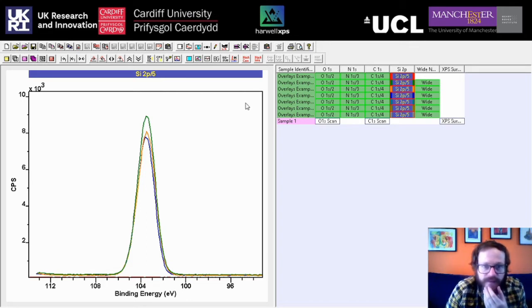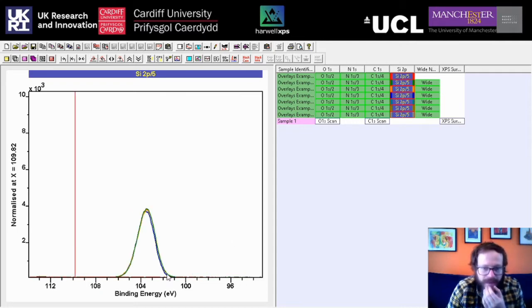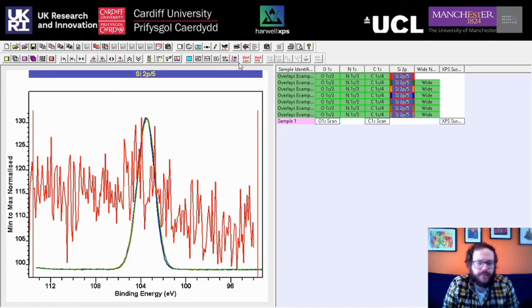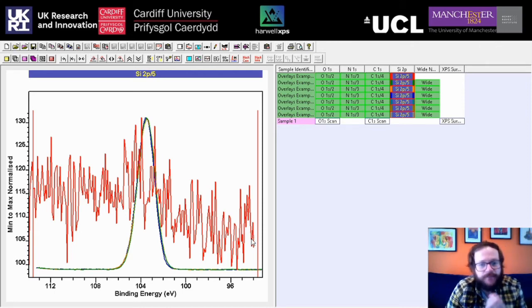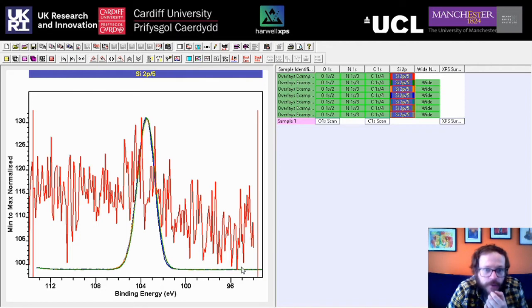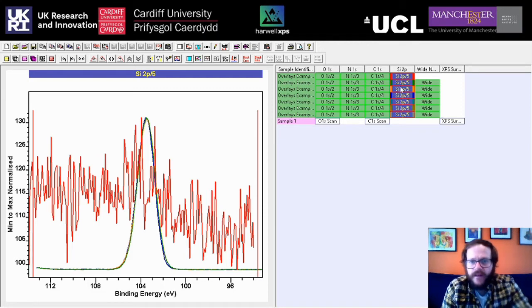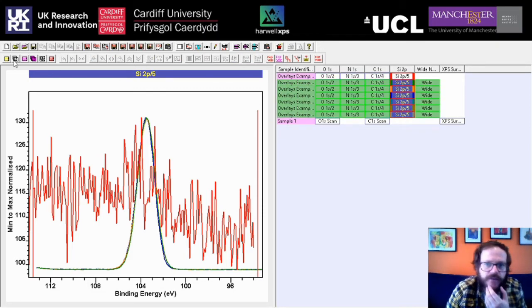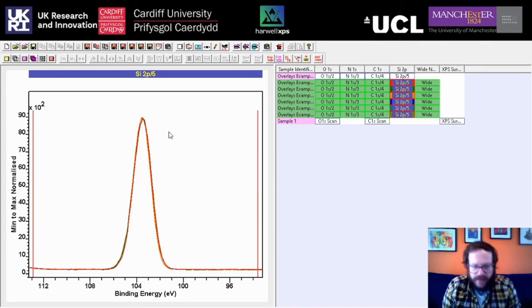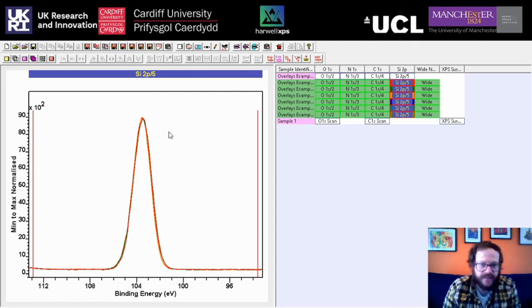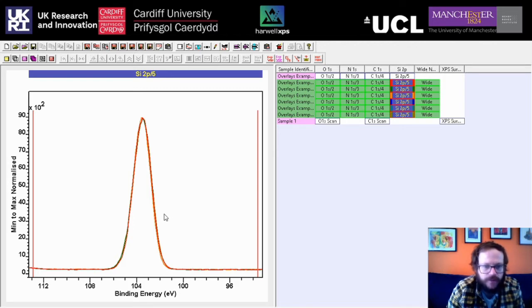One way to treat the overlaid data is to use the Normalize function. Click it once and it will normalize to the baseline; click it again and it will normalize based on the minima and maxima of the peak. We can see that one sample which doesn't have any silicon has been normalized to the noise floor. If we just highlight the samples that do have silicon and plot those, they overlay very nicely — the silicon in all the samples is the same with no deviation in line shape or width.